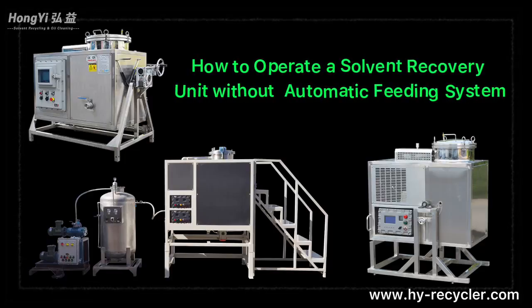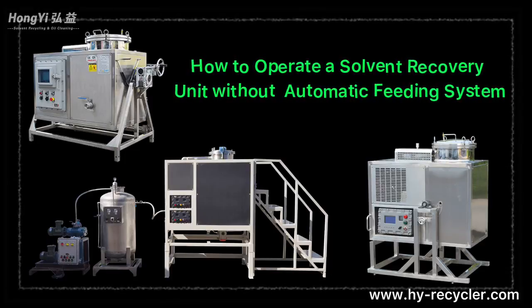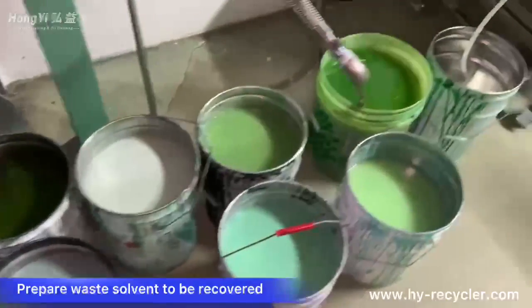How to operate a solvent recovery unit without an automatic feeding system. Prepare the waste solvent to be recovered.